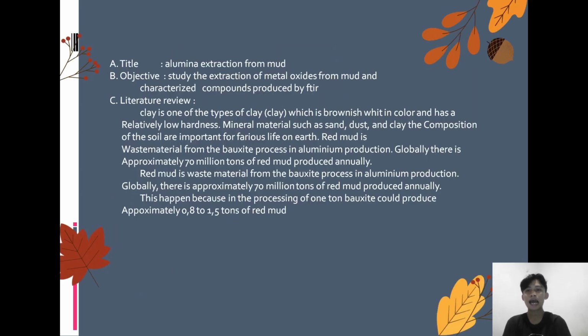The title: Alumina extraction from red mud. The objective: to study the extraction of metal oxides from red mud and the characteristic compounds produced, using FTIR.